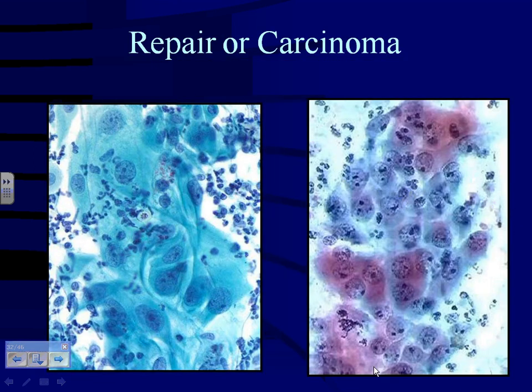All right, now just to give you a little hint here, a little preview. Okay, one of these is repair, one is malignant. Which one is which? What was that? Which one is that on the left? Is that repair or carcinoma?